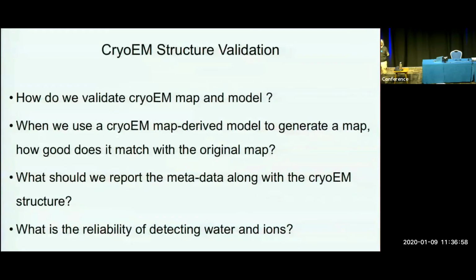But I think now we are getting a map at 2 or 3 angstrom. What can we say about water or metal, in addition to the amino acids or nucleic acid bases or sugars or lipids and that kind of stuff? So these are the few points I'd like to cover in the next few minutes. First, let's define what we mean by resolution.